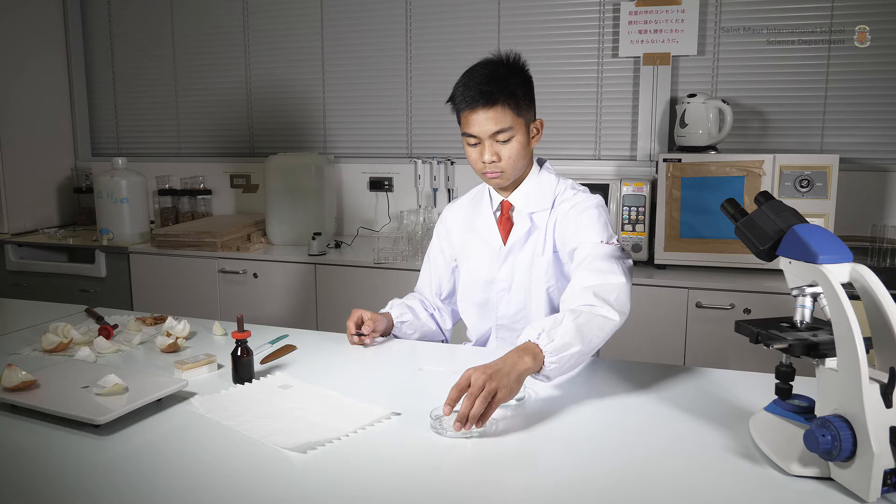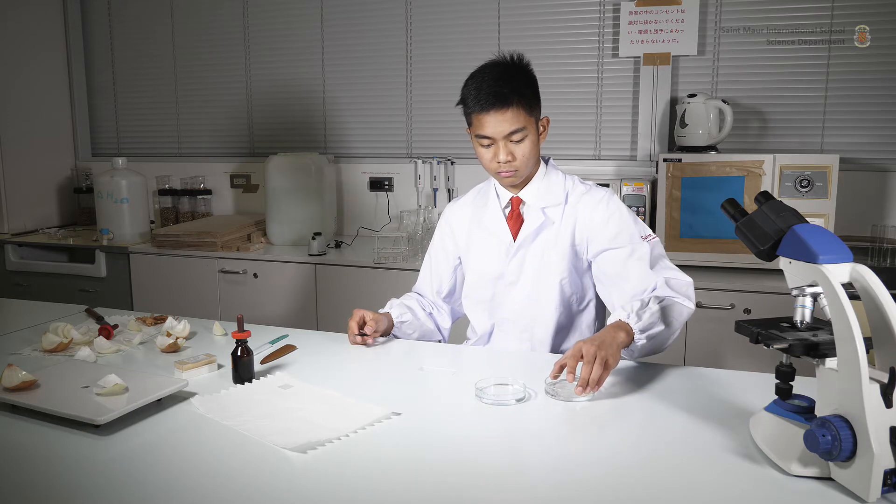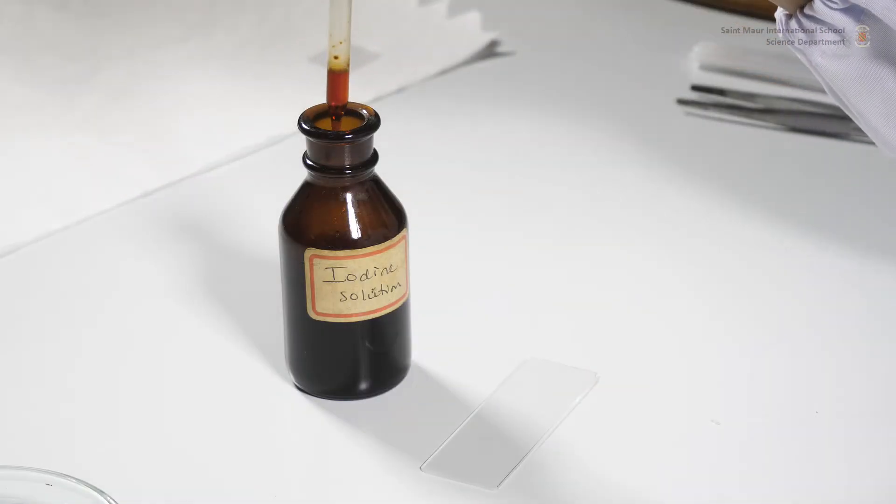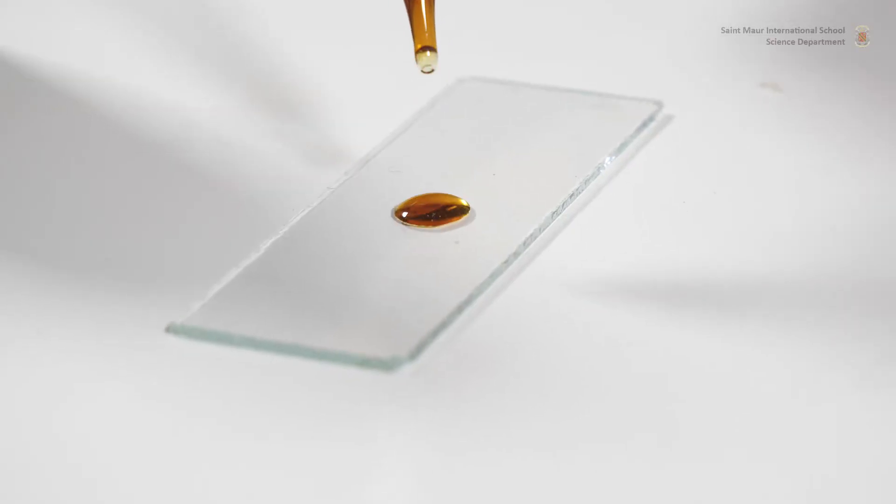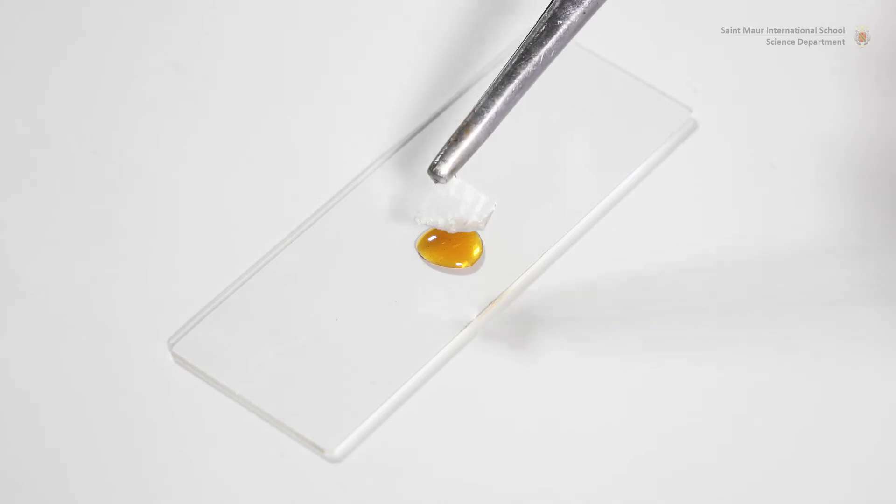Mount one section between a slide and a cover slip. To enhance the contrast, use iodine instead of water. Iodine will stain starch and become darker as it gets concentrated when the cells lose water.